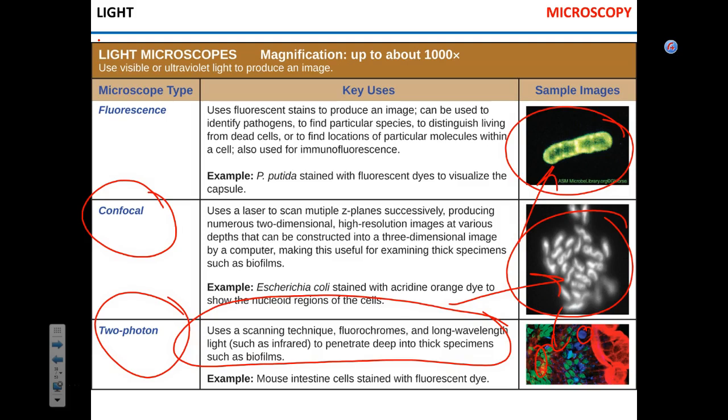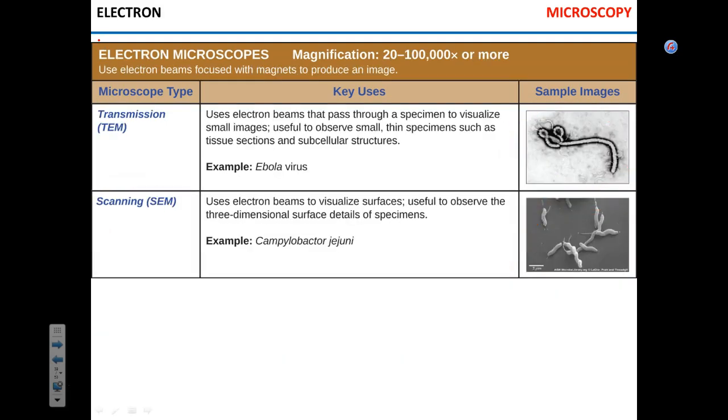The most expensive part was the laser, that lights up those cells. The laser cost $250,000. I was shocked. It's like, holy cow. We have that amount of money? But it produced absolutely unbelievable images and great movies about the cells. Of course, it's not just to produce movies. It's much easier to see how the cells interact, where they go, all that kind of stuff.